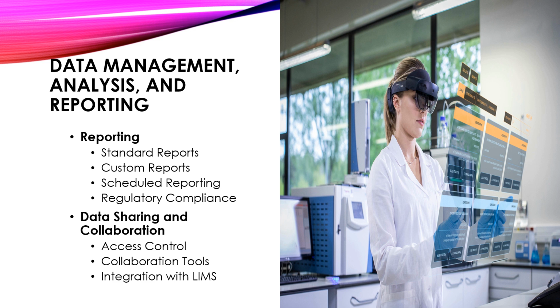Now, in summary, laboratory management systems streamline data management, analysis, and reporting processes in laboratories, ensuring efficiency, accuracy, and compliance with regulatory standards. And these systems play a crucial role in enhancing productivity, enabling informed decision making, and maintaining data integrity in laboratory operations.